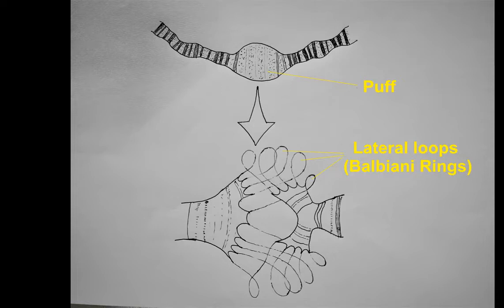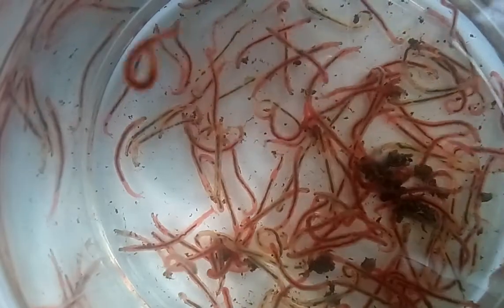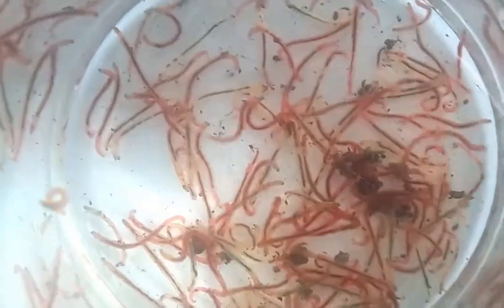Polytene chromosomes are found in various tissues such as the salivary gland, rectal and Malpighian excretory tubules in the larvae of some flies, as well as in several species of protozoans and plants. In this experiment, we're going to prepare temporary stained slides of polytene chromosomes isolated from the salivary glands of the larval stage of the chironomous insect, also known as the bloodworm.